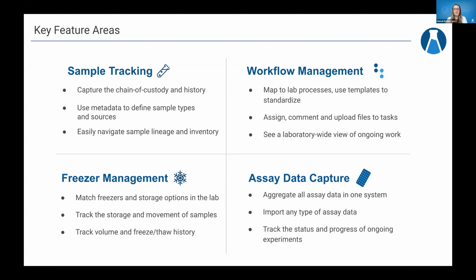I'm not surprised, frankly, from the people that we talk to, the groups that we have today. Sample registration obviously is a very big component, but it's only one component of how samples are dealt with in the lab. So seeing freezer management is really exciting because that's where we spent a lot of our effort this year. Workflow management and assay data integration. It's great to see this because these are the parts to me that make Sample Manager stand out among other products. And then of course, data centralization. If you knew nothing about LabKey before you came to this conference, we're all about data centralization. So exciting to see that too.